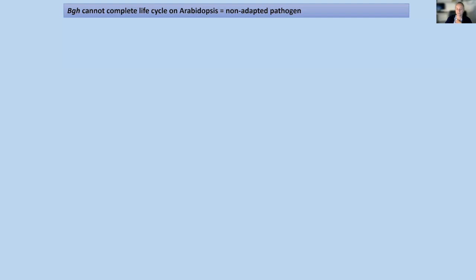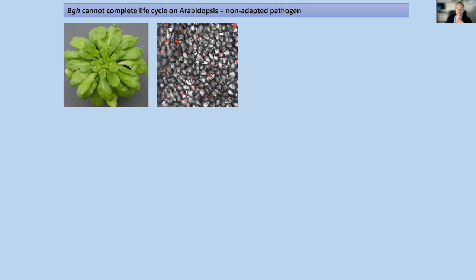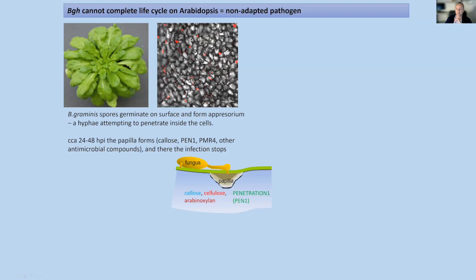So how are we trying to solve the barley resistance to Blumeria? We use a plant which is naturally non-host, Arabidopsis. We aim to use the mechanisms by which Arabidopsis is non-host to protect barley, which is the susceptible host. So we use the non-host system. We apply the pathogen spores on Arabidopsis surfaces with the same inoculation tower approach. In this case, the resistance in Arabidopsis is based on papilla formation, a very specific structure, a reinforcement of the cell wall around the plasma membrane that helps protect against invasion. In barley, this structure also forms, but it's mostly unsuccessful, while in Arabidopsis it's mostly successful.